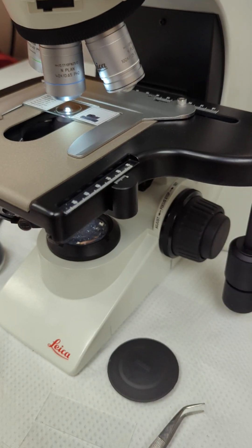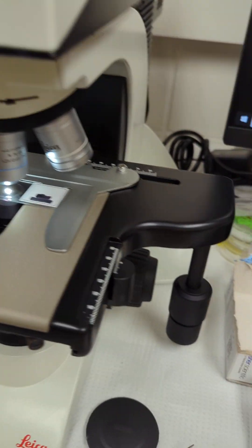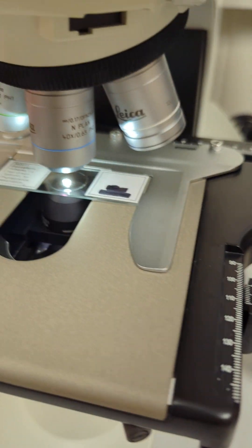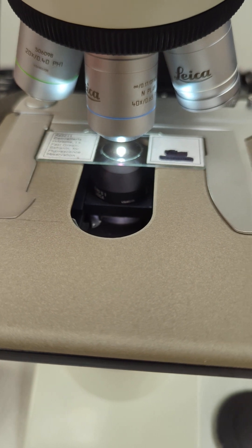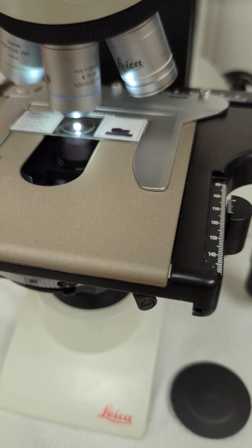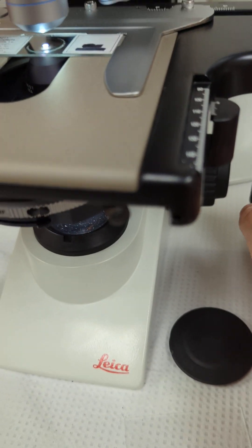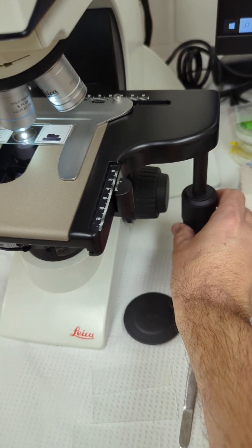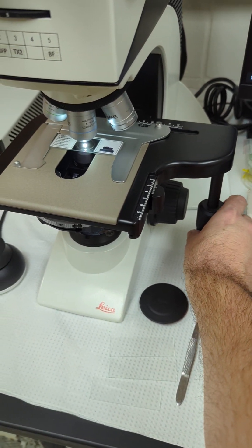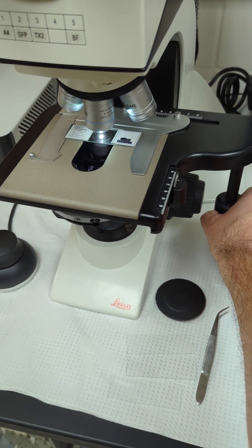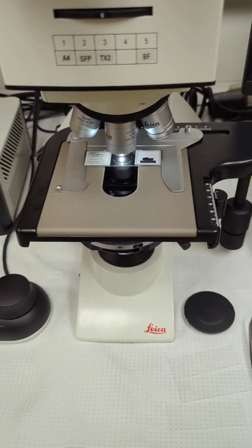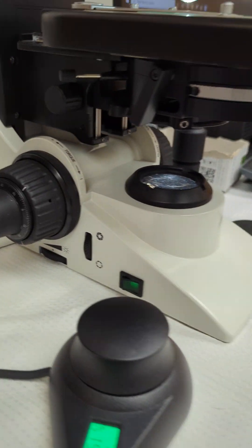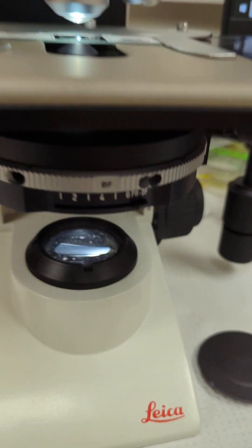You've got your stage finger to load your slides, everybody's pretty aware of that. And then your X and Y for moving your sample back and forth.